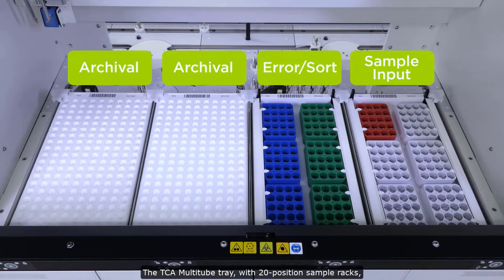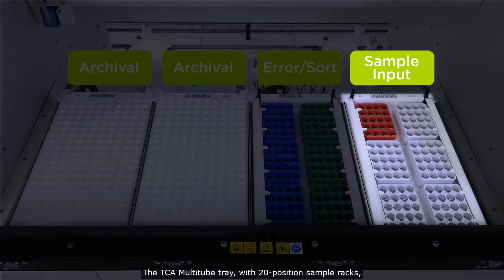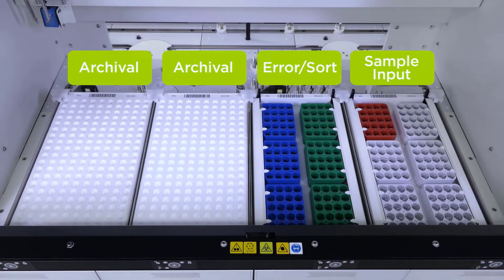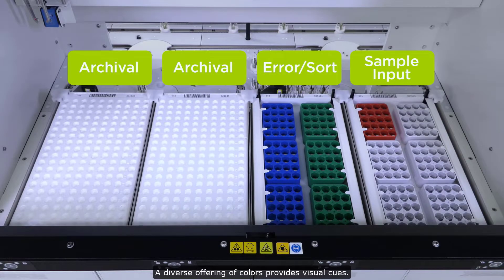The TCA multi-tube tray with 20 position sample racks is typically used in the input and error/sort drawers of the ESFlex. A diverse offering of colors provides visual cues.